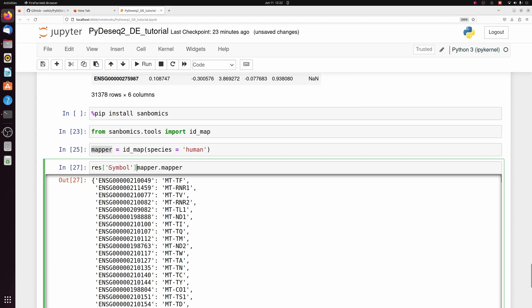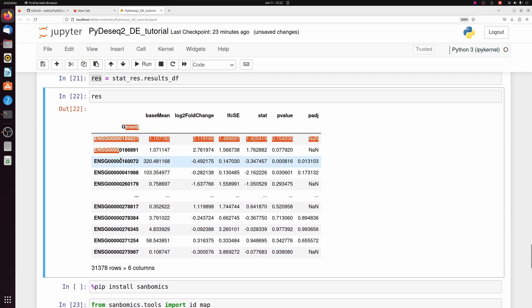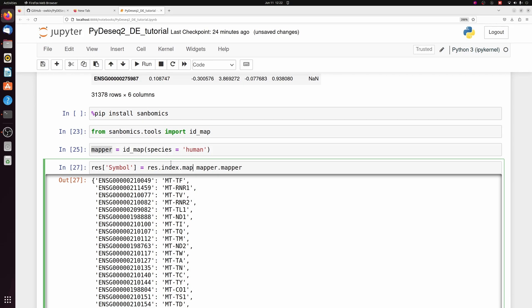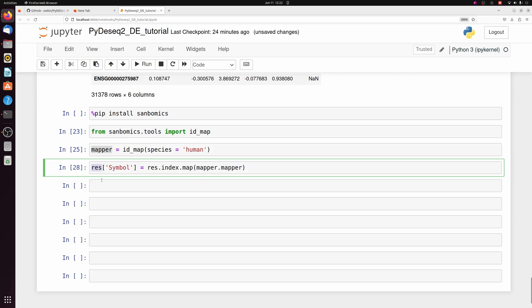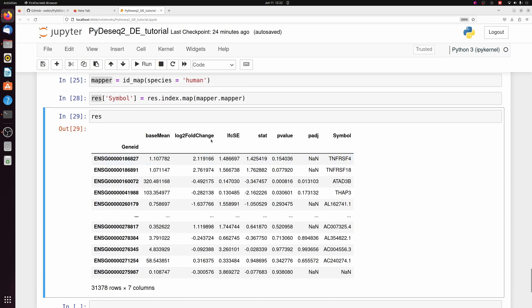But what we can do is make a new column in res. We're going to call it symbol. It's going to be res.index, which is just the gene ID column, and we're going to map this mapper across it. We have the actual gene symbols.